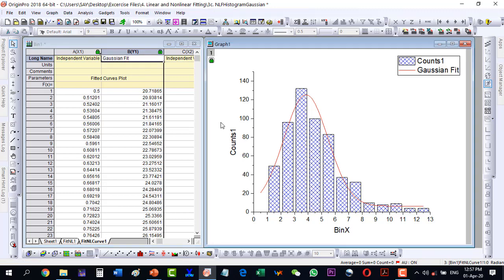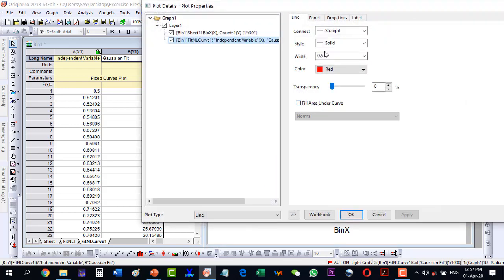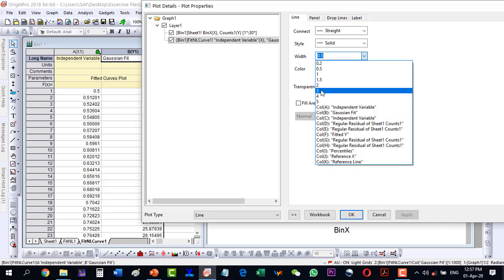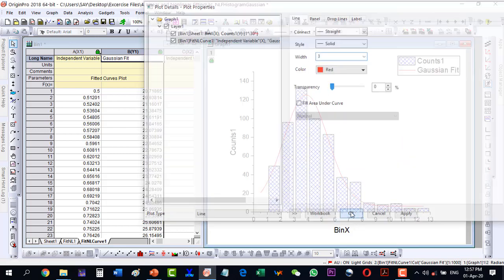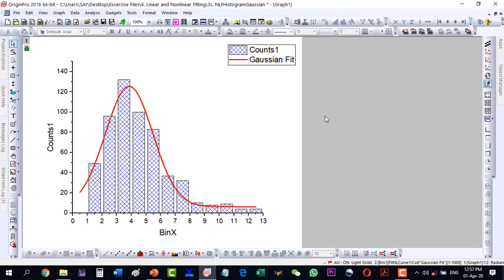Here I just click the Gaussian fit and the data is like this. So just change this one a little bit - the width of it. Let's say it is three and we are having the fit like this. So we can fit a bar graph as well with a Gaussian fit.